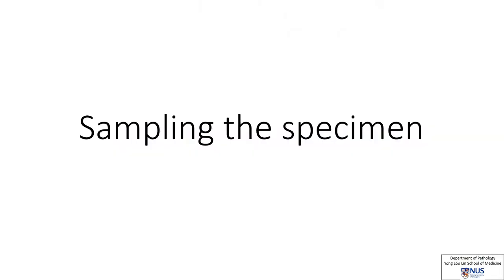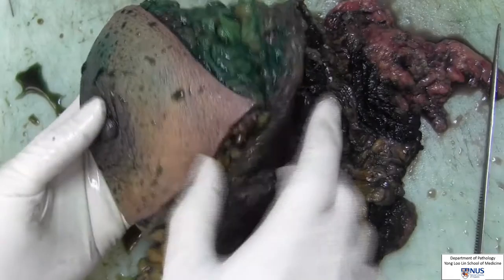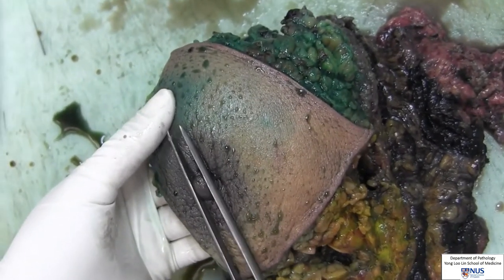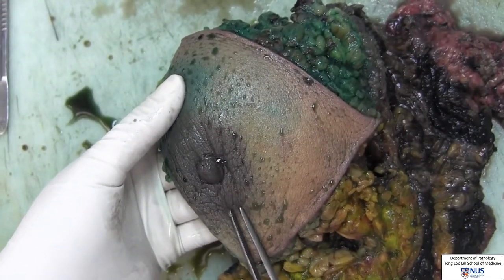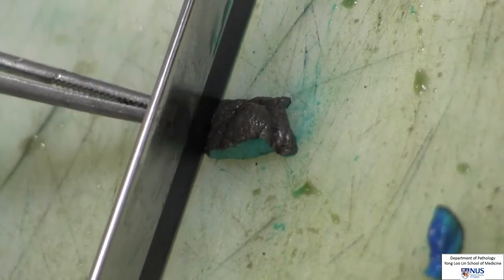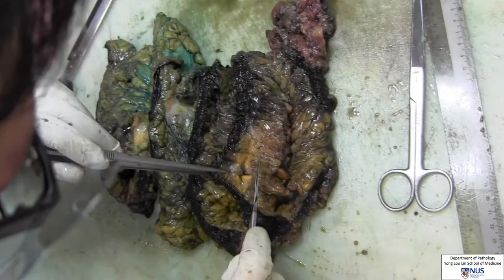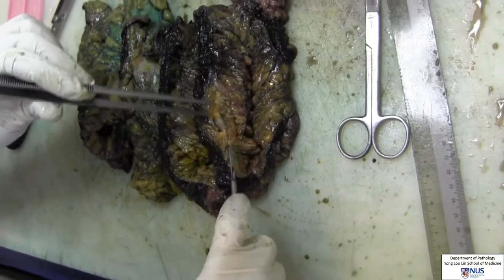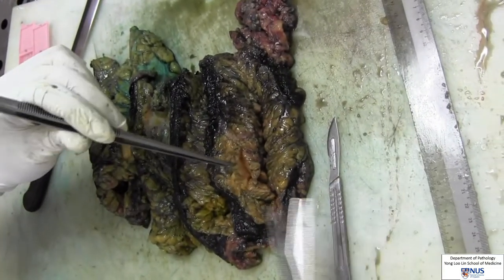We move on to sampling of the breast specimen. The benign regions will be sampled first before the tumour to avoid contamination of benign tissues with residual malignant tissues from the instruments. We will sample the nipple to assess for Paget's disease, then proceed to sample normal breast tissue from quadrants of the breast uninvolved by the tumour.